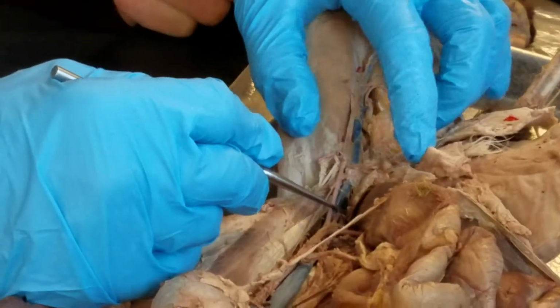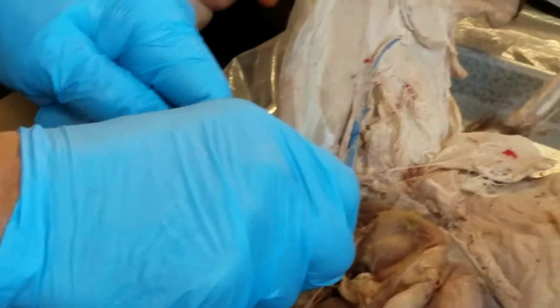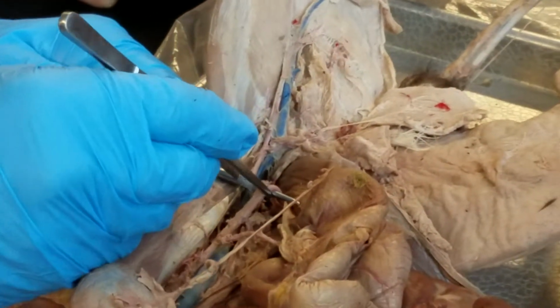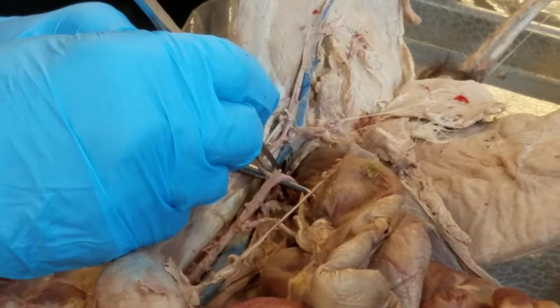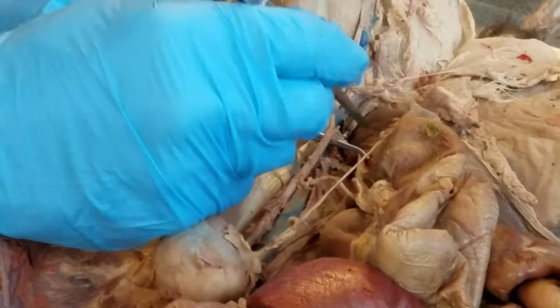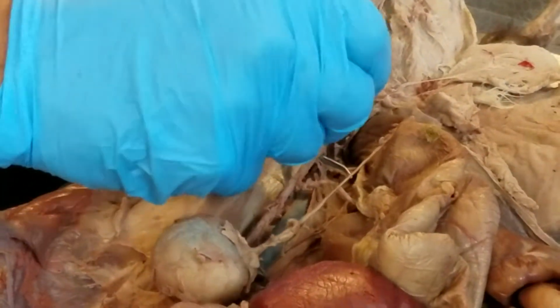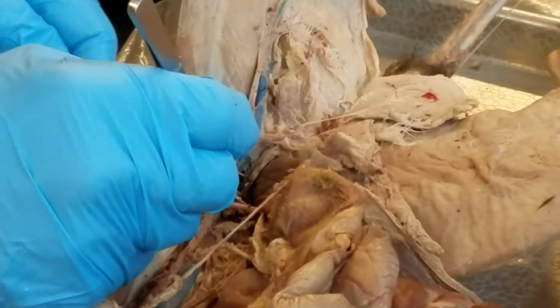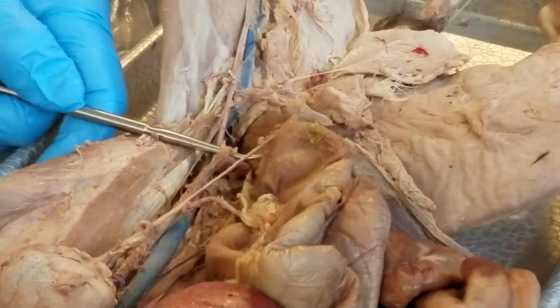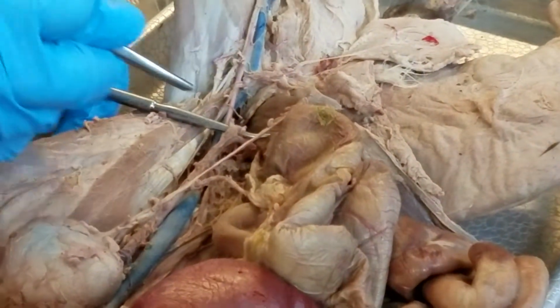Okay, now, if we raise this whole thing up so you can see it nice, like that, we're going to actually see this little piece right here with the common iliac artery, and the ones deep going down into the pelvis are the internal. So here's your externals, and there's your internals. And there's the common, that little tiny piece which is as big as the end of the probe, right there. That's the common. You see it right there.